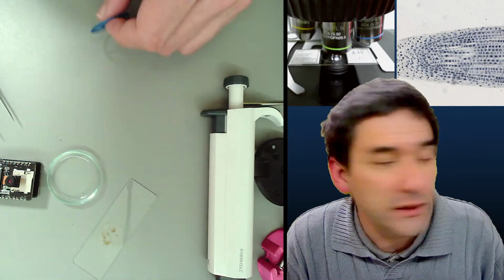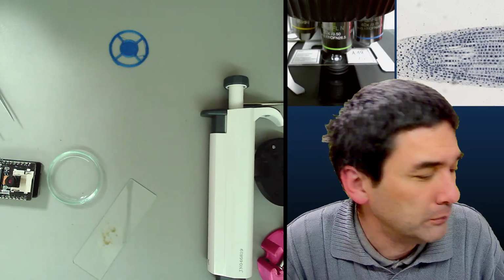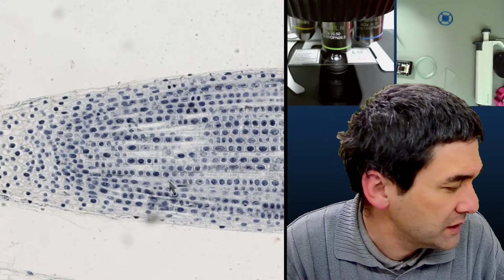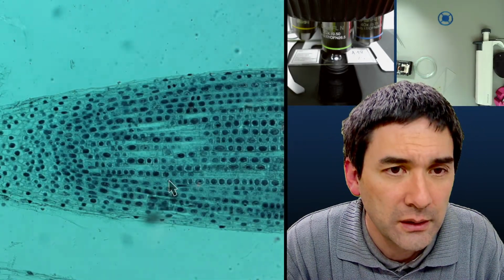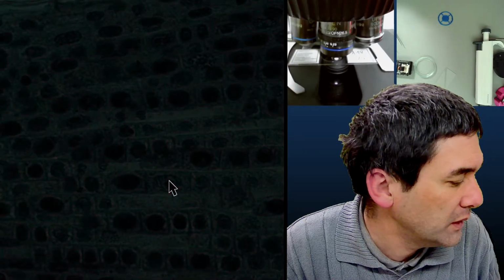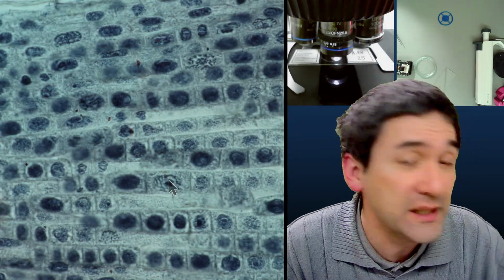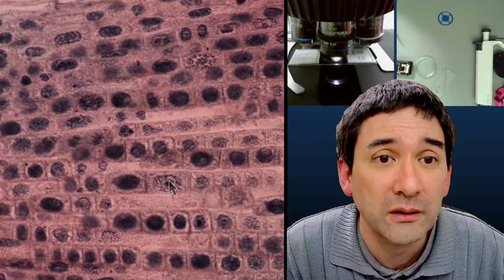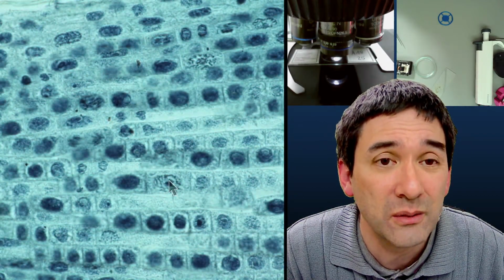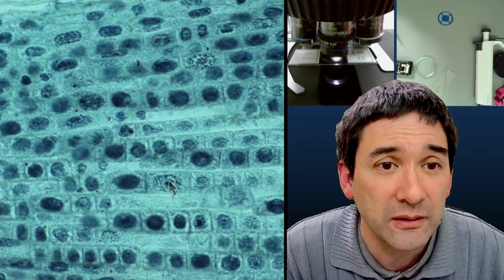Okay, can you check your onion sample with DIC? To see if more details are visible, most likely not more details. Because, so this is now the 20 times, so let's go up to 40 times and 60 times. I have to change the thing here as well, go up with the color, open the condenser a little bit, and that is now DIC. Now when I turn this, you see there is not a huge difference.